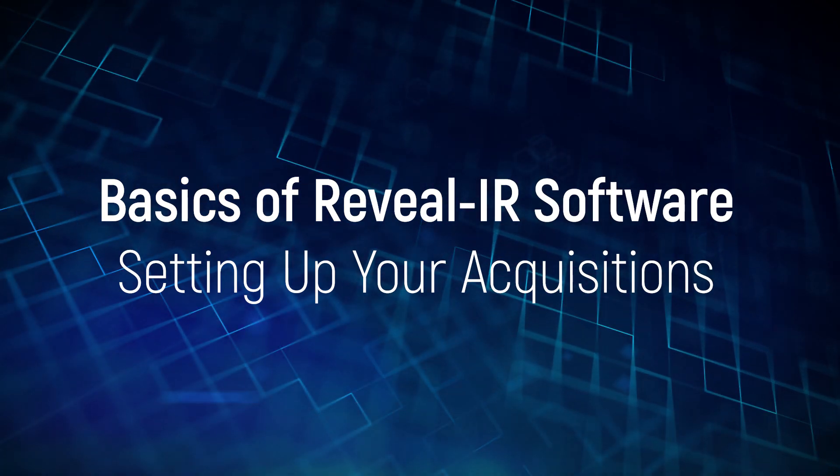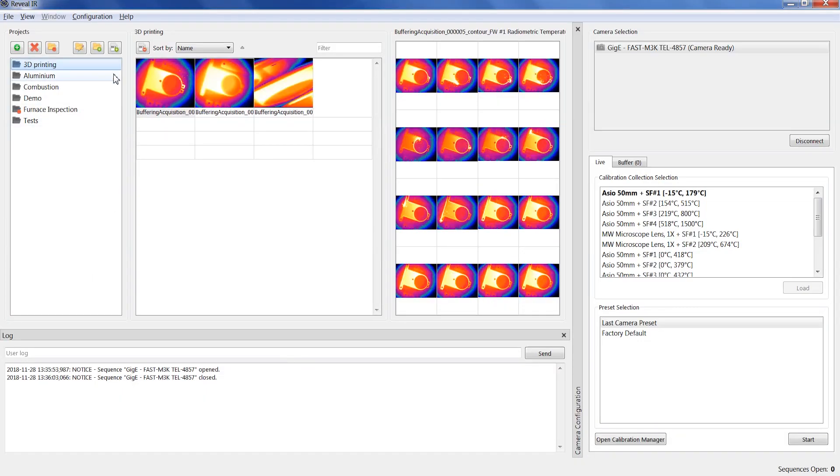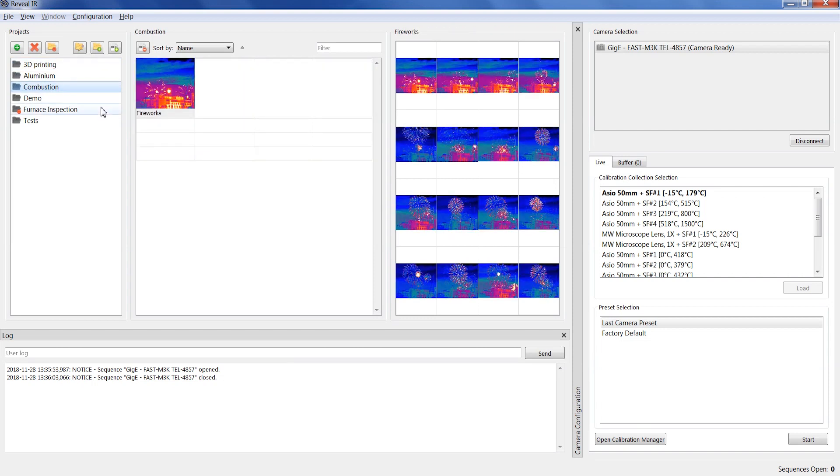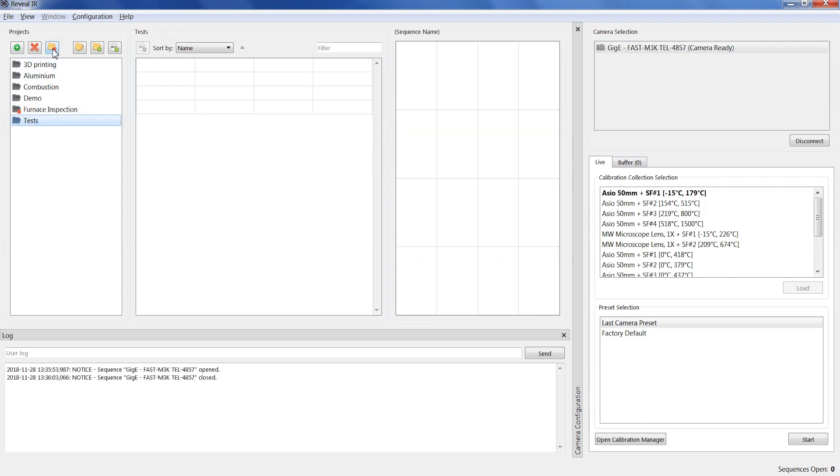In the main window of the software, you see all the projects that are already created. The red circle indicates the output project where the next sequences recorded will be added.